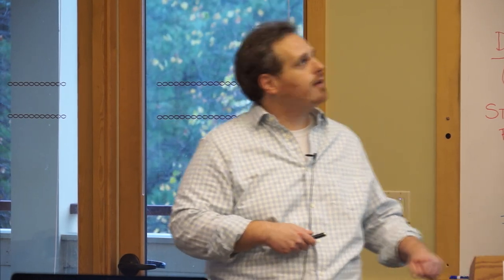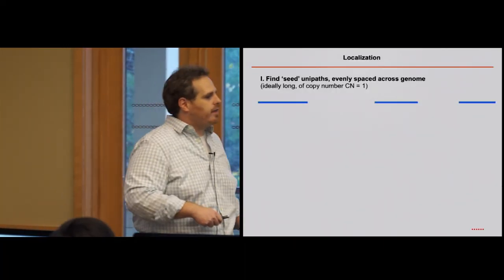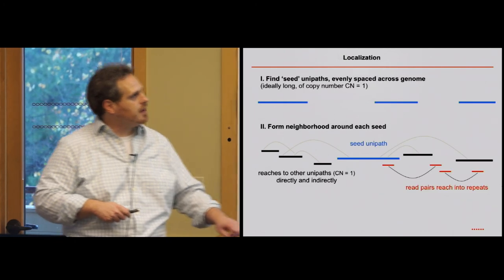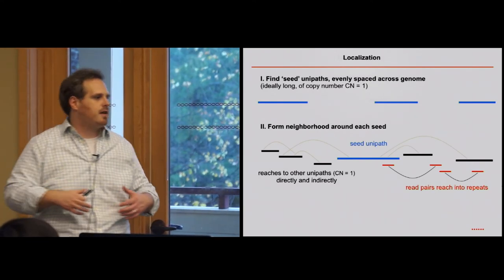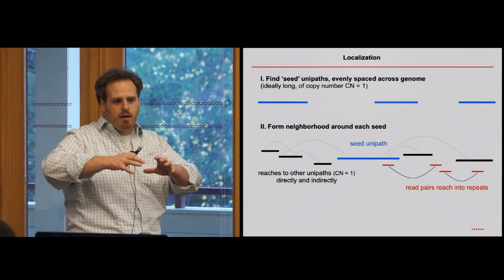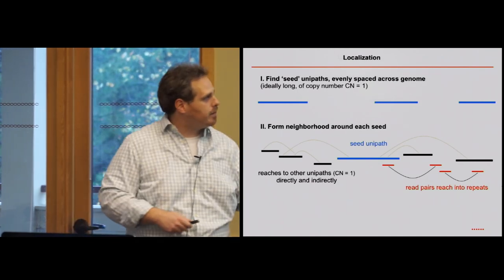So once we have that, we're going to build up the de Bruijn graph, just like we saw with Charles Dickens, compress it down, and apply that scoring function to try to find long contigs that we think are unique based on their coverage. So here I have just a few of these. And then the next major phase will be to pick out the best ones, and then using the mate pairs, try to figure out from this long big contig what other contigs are connected to it. It'll look at the coverage as a scoring function to figure out what else is unique, and then try to grow out, in this process, from the biggest and most confident to less reliable sequence, these scaffolds to be bigger and bigger.